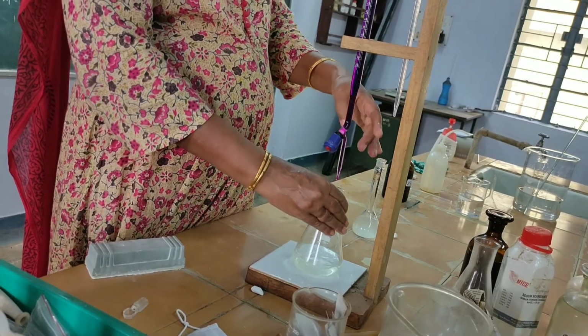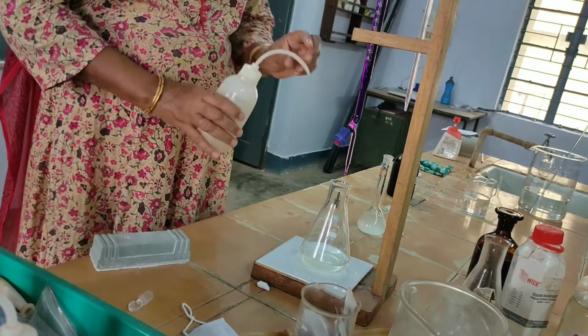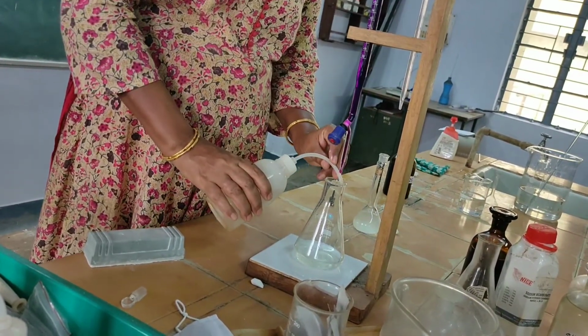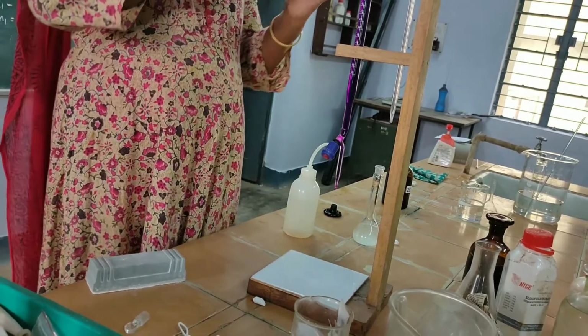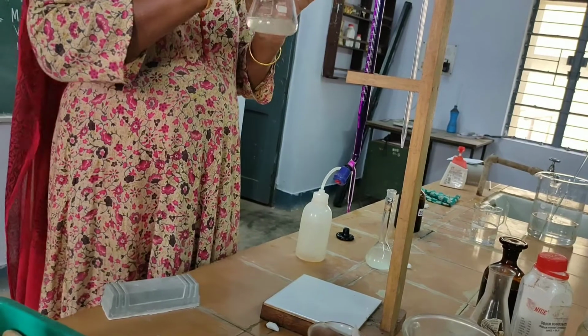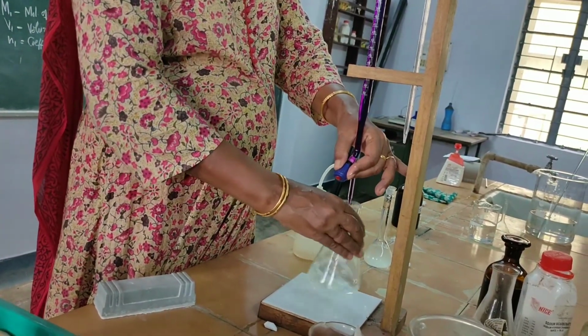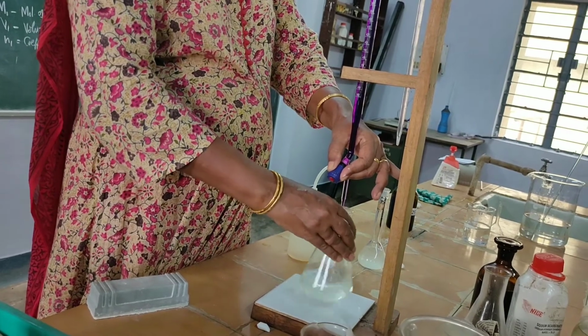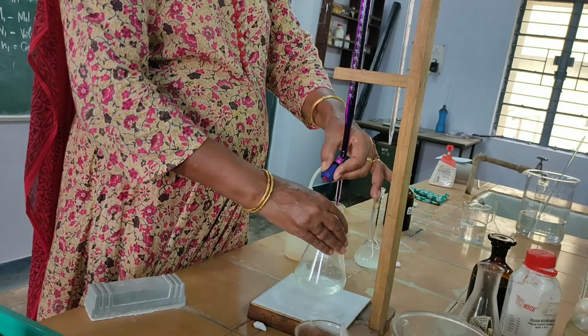In between you will have to check whether any color is there on the sides. If there is any colored liquid remaining, you will have to wash it down with water. Because if any potassium permanganate color is there, that means that much volume we are reducing. So we will have to be very careful. On the sides of the conical flask there should not be any pink color. So very carefully you will have to do the titration. It is a quantitative analysis.